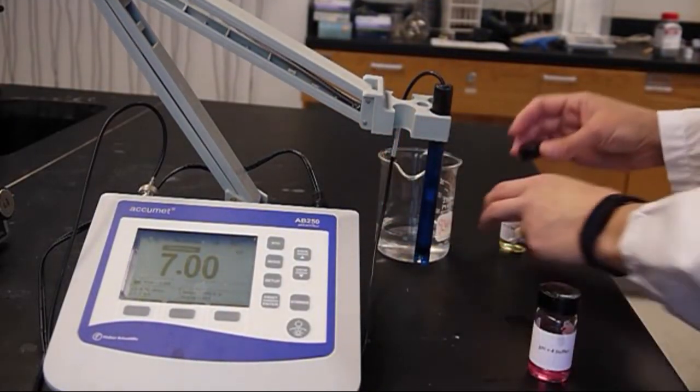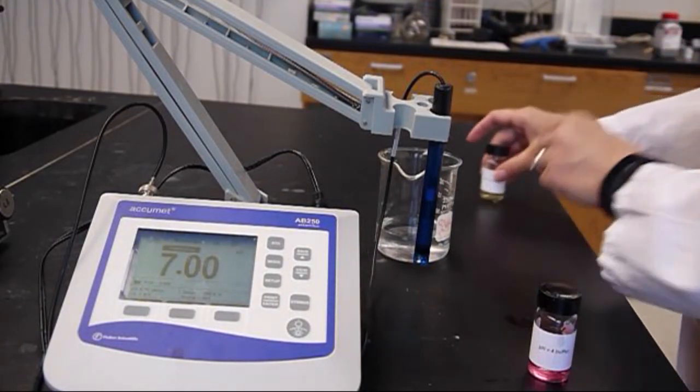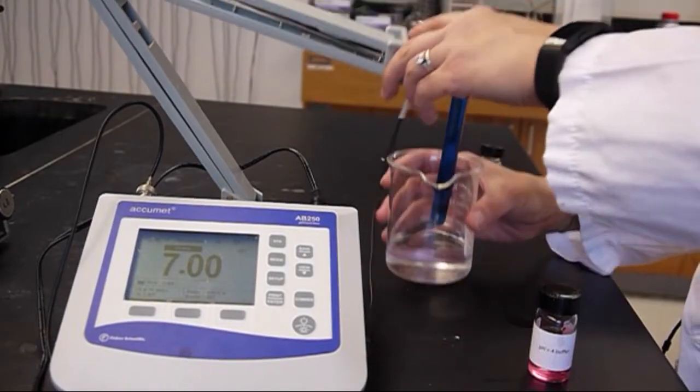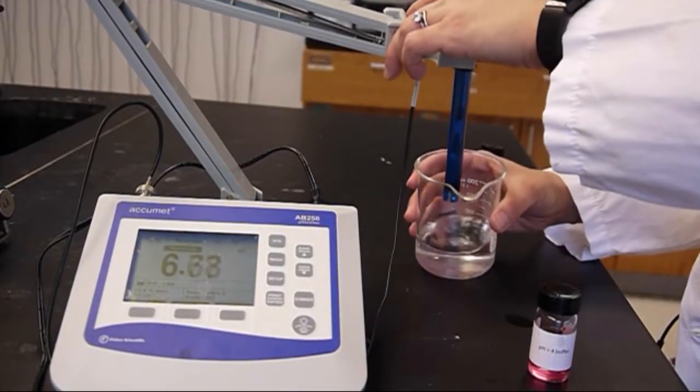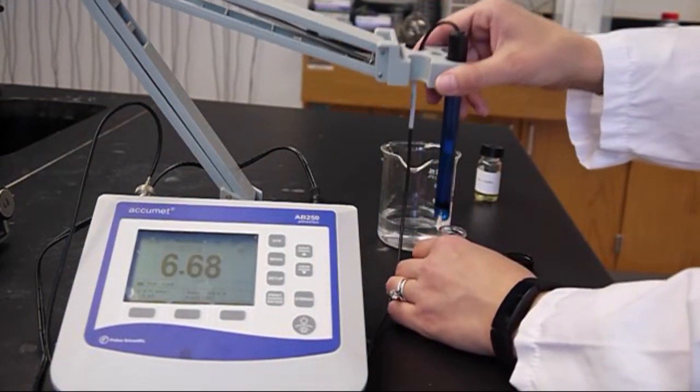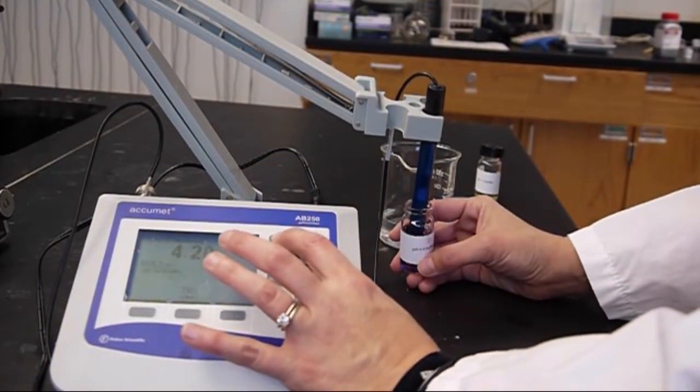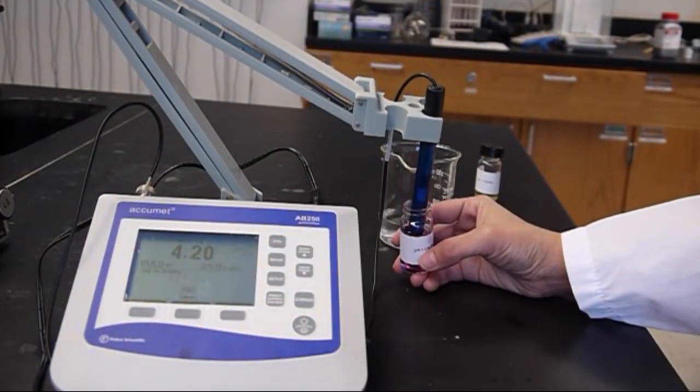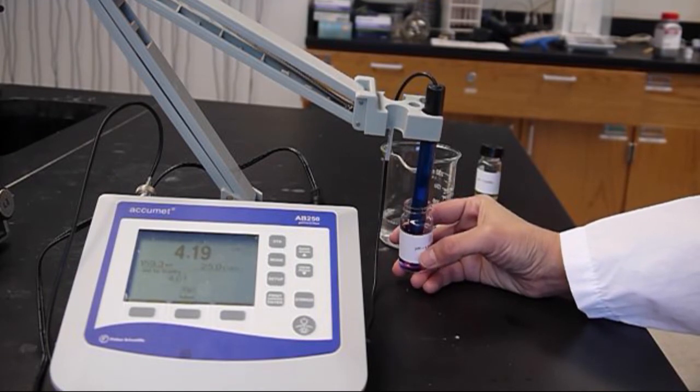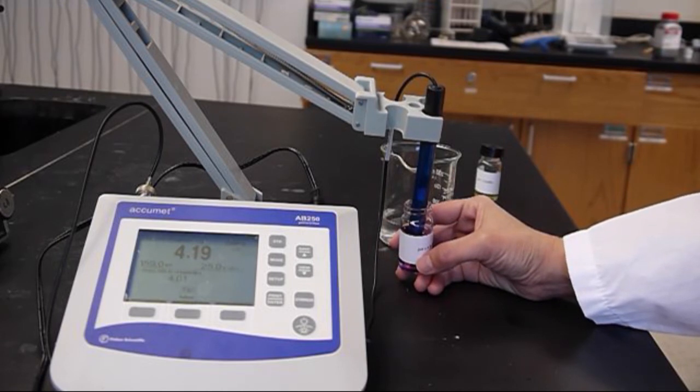Then we will give our electrode a quick rinse in some water, swirl, you can dab it dry with a Kimwipe and then place it in the pH 4 buffer and again press the standard button. So the pH meter should recognize that the pH is around 4 and then we'll know that this is a pH 4 standard or pH 4 buffer for the standardization process.